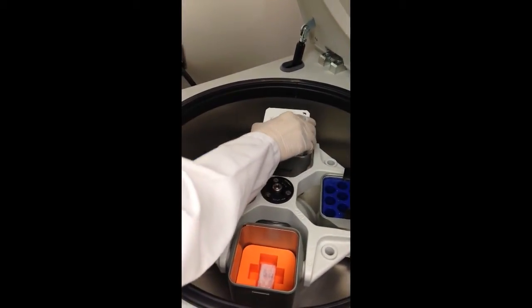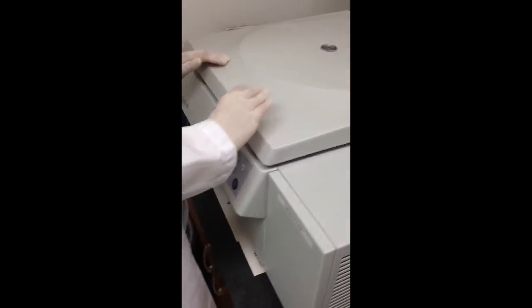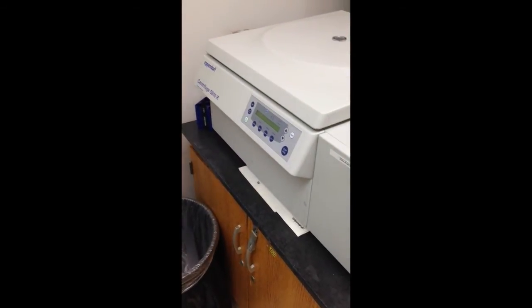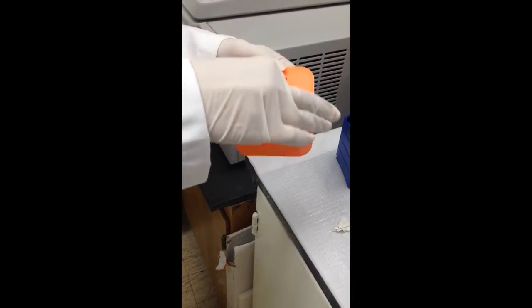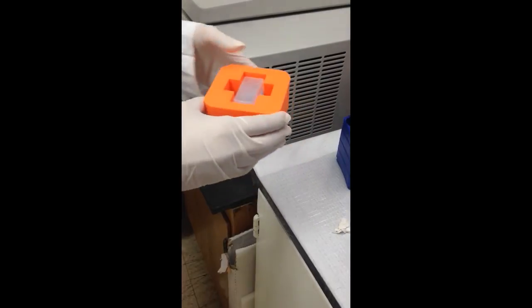Over the course of the summer, we experimented with different adhesive agents to see if the retention rate of mitotic cells could be increased. We found that the optimal agent that left the wells with the least amount of debris and the most amount of cells was polylysine. In addition to this, we are also working on a padding to coat the bottom of the application to help lessen the force of impact against the wells while in the centrifuge.